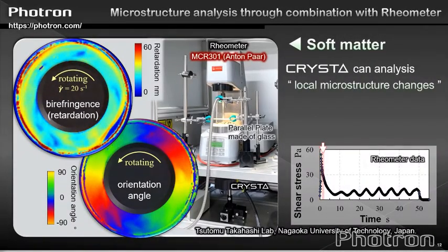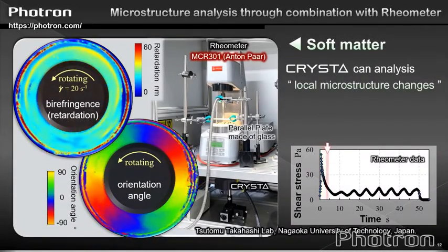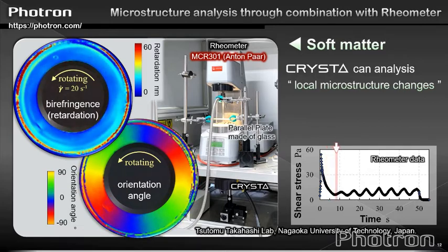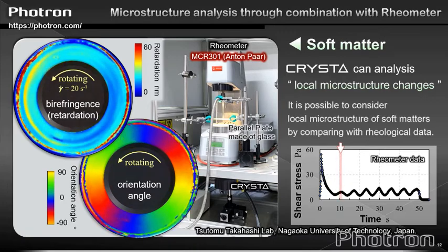Equally easy, the CRYSTA can be integrated with a wide variety of other lab systems. Here it's shown connected with Anton Paar's modular compact rheometer, the MCR301.